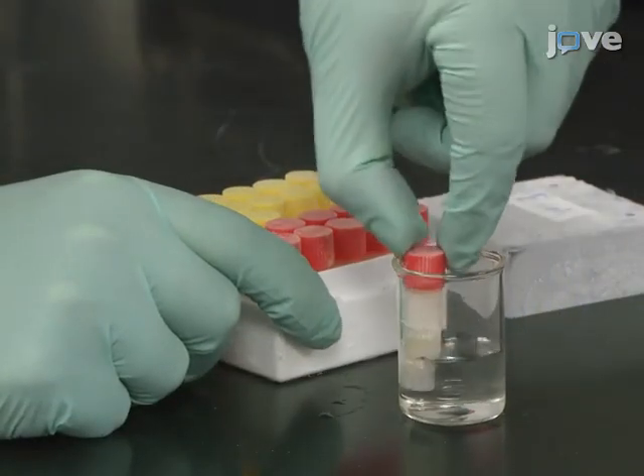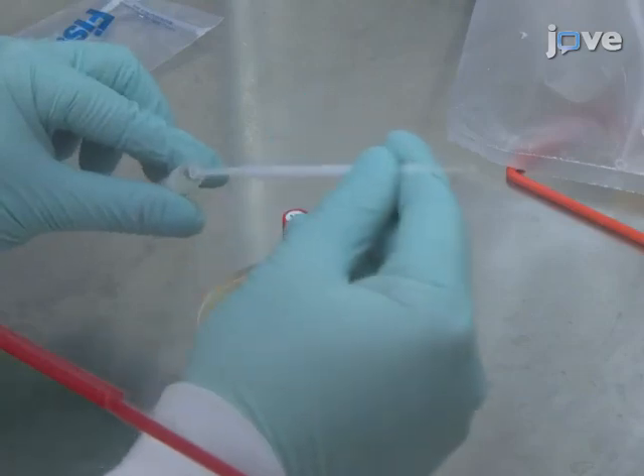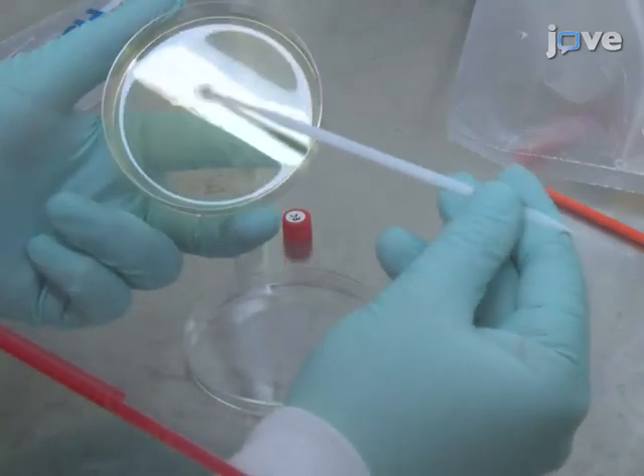Next, revive the E. coli by thawing the frozen bacterial stock and plate the suspension on E. coli agar for a 24-hour incubation at 35 degrees Celsius.